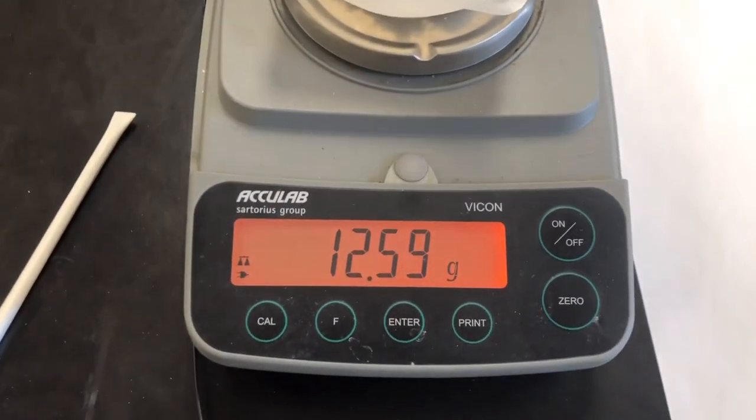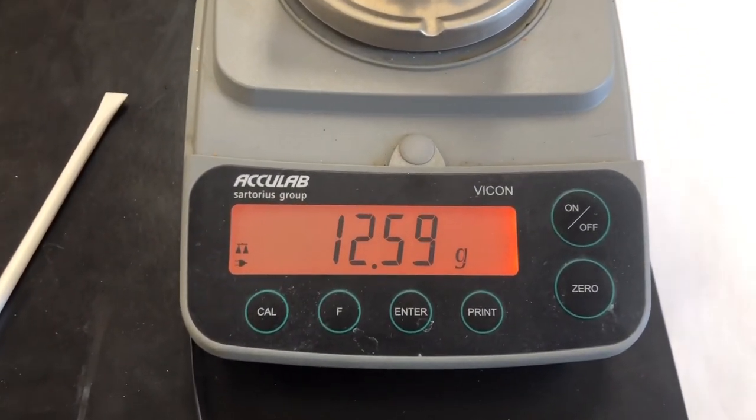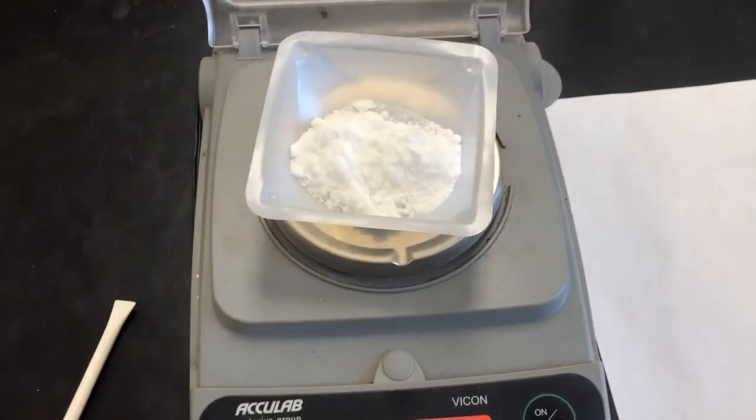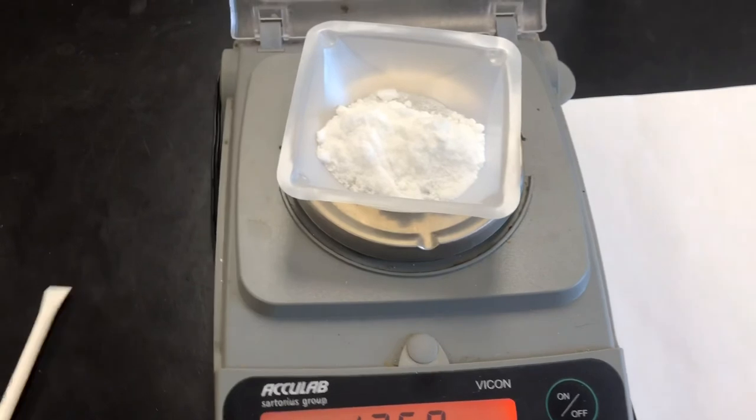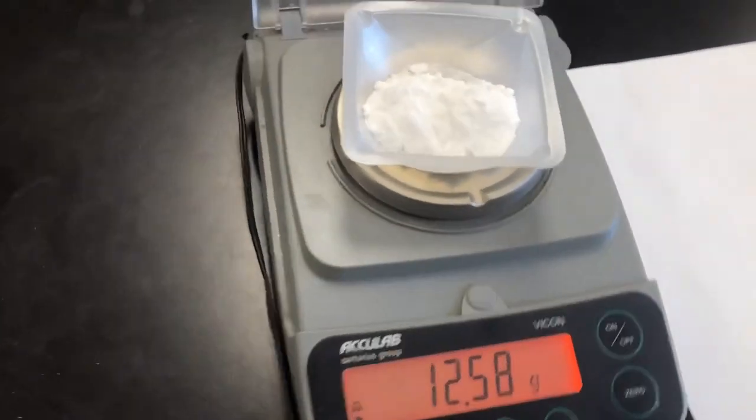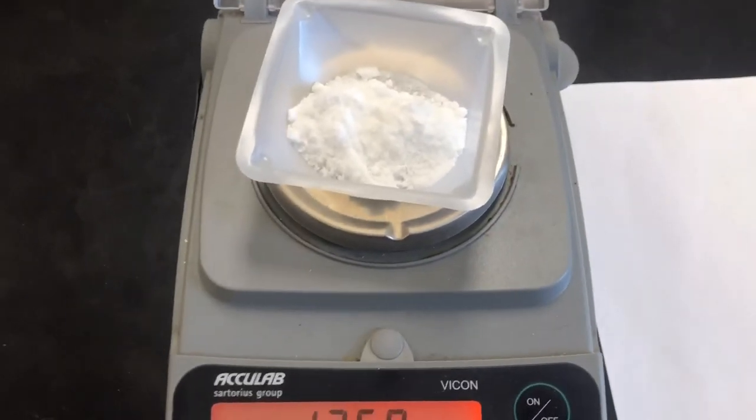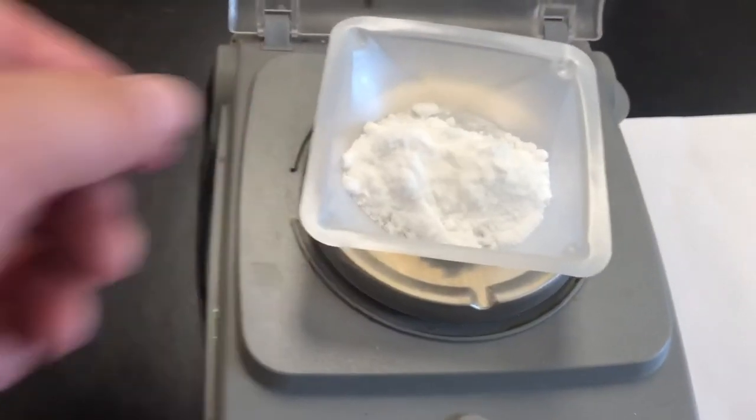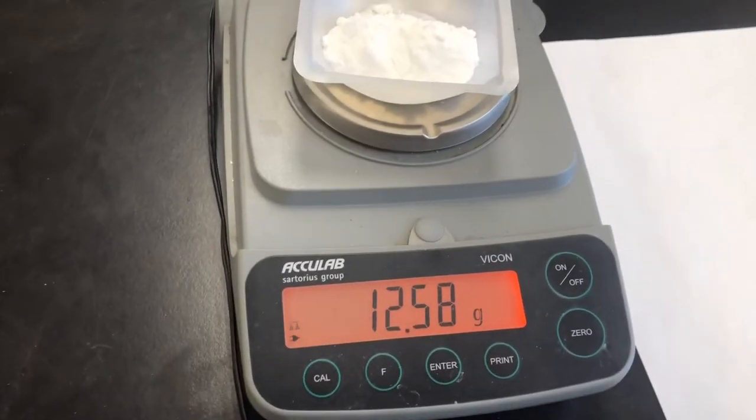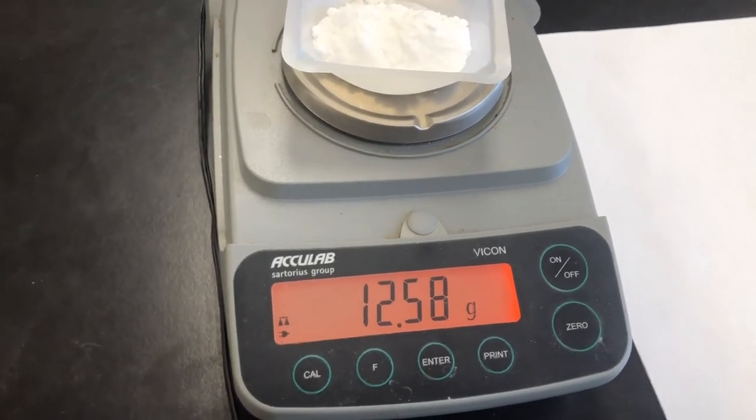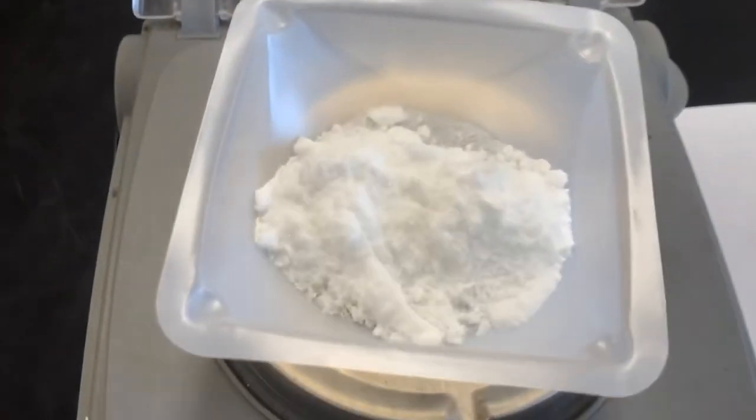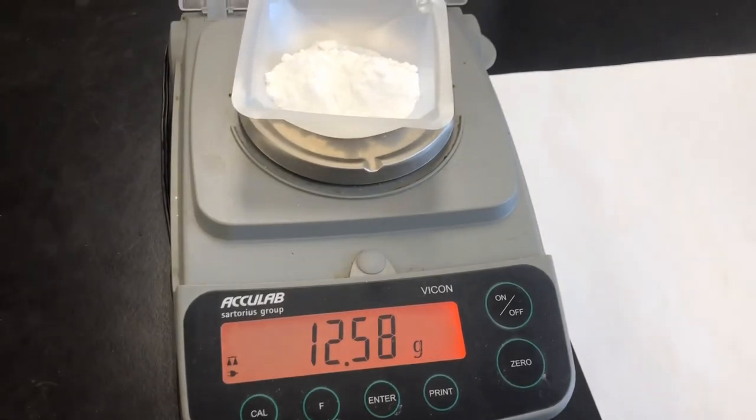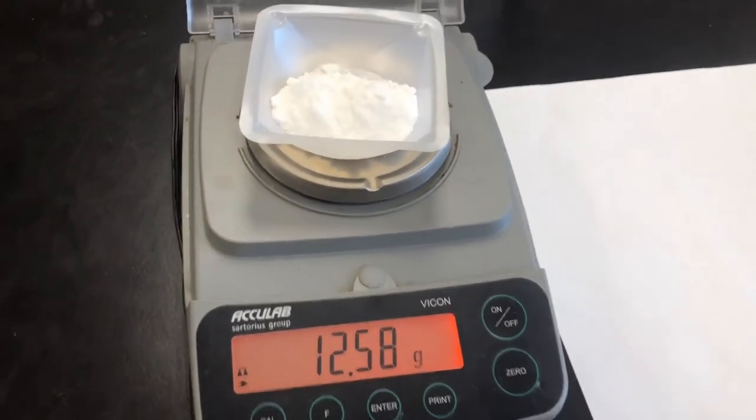After transferring we have 12.59 grams. The average percent yield for most high school chemistry students is 48 to 60 percent, so if this is above 100 percent, obviously it's probably not dry enough. So we have 12.58 grams of material that we have recovered. See what our percent yield is and get that written up and put into Google Forms.